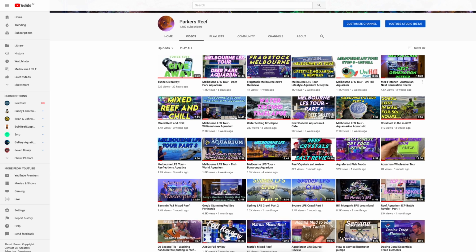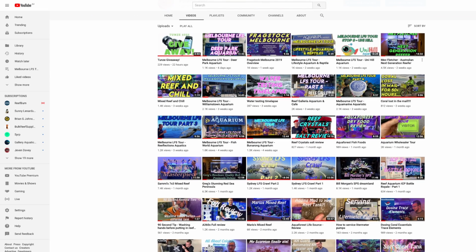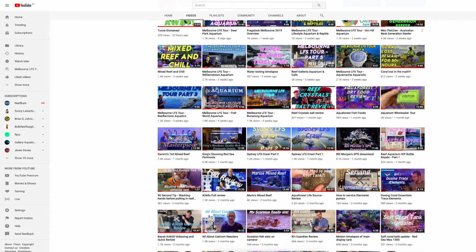In Australia now, we have access to 4 different ICP companies. Probably technically more than that, but 4 that are dedicated to the aquarium industry. And the question's always been which is best, which is more accurate, what are the advantages, disadvantages, etc. So I figured I'll just buy one of each and take the same sample of water, send them off and see what we get.